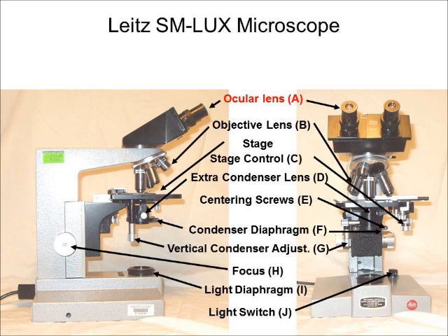First we have the two ocular lenses which, as the name implies, are the lenses closest to your eyes. Typically these have a 10x magnification and contain a wire pointer. They can be adjusted for each individual's requirements. In particular you can adjust the intraocular distance and you can fine tune the focus by rotating the lenses.